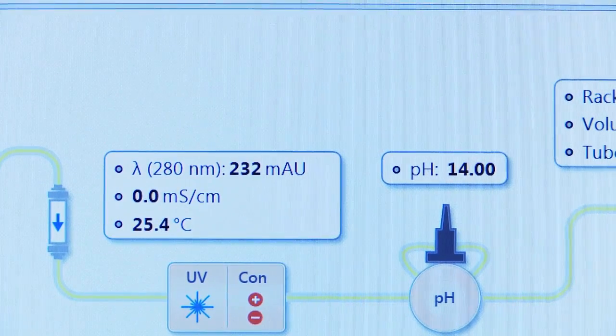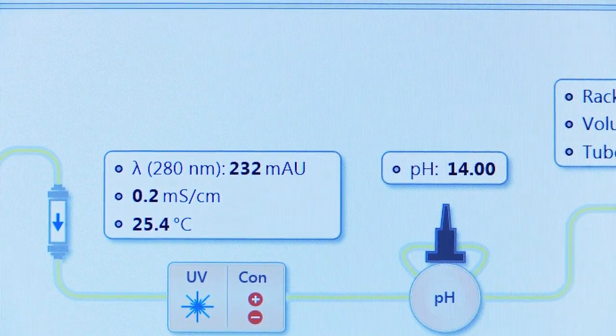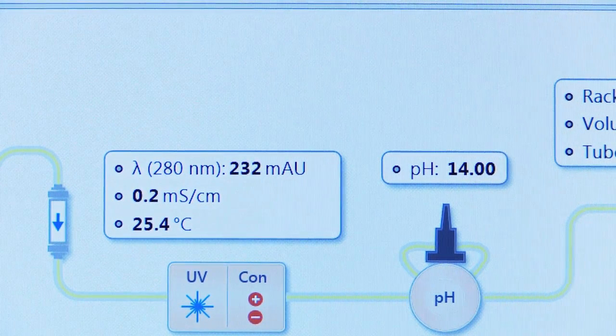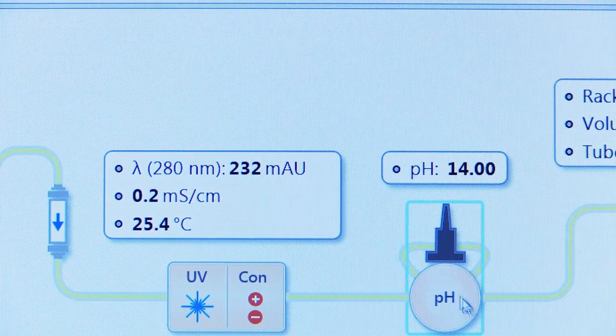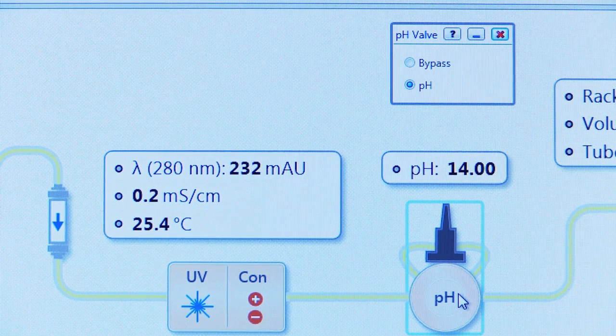You can also use manual mode to verify successful installation. Double-click the pH valve icon in the Fluidic scheme. This opens the software faceplate for the pH valve.